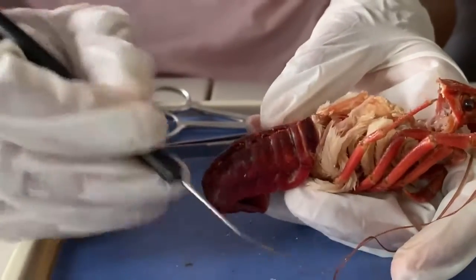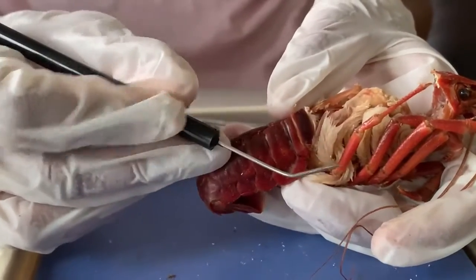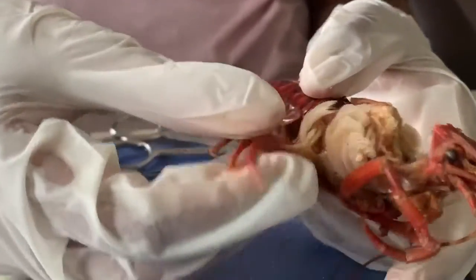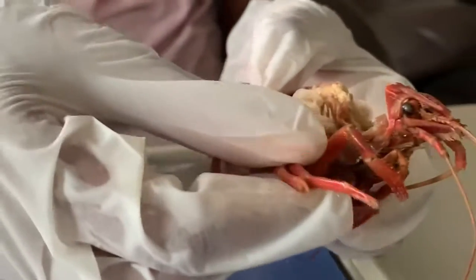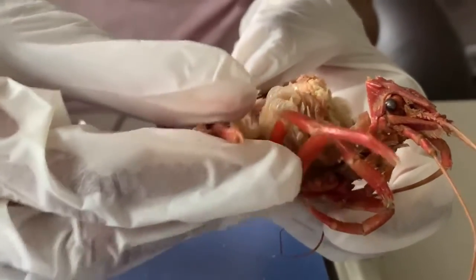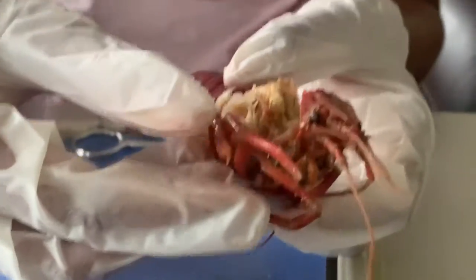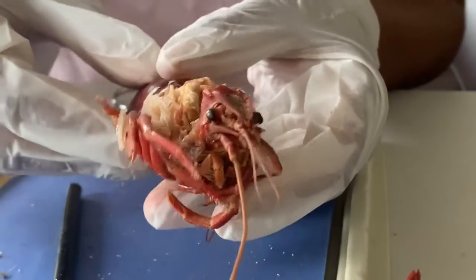You may be wondering: a hard exoskeleton is covering the gills, so how do the gills get access to the water? Well, the gills are connected to the walking legs of the crayfish. So while the legs move, the gills move too. When the gills move with the feet, water is able to go underneath the exoskeleton to the gills so that the gills could do their job.